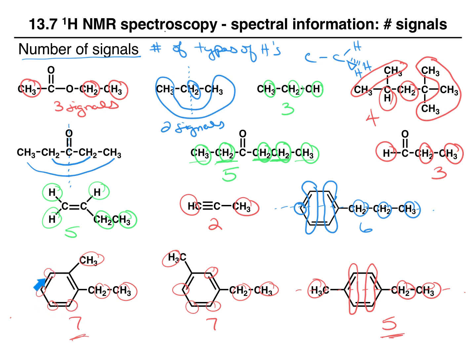Sometimes we will be able to identify 4 separate hydrogens in the aromatic region, and we can get that detail. In other cases, we're just going to focus on how many hydrogens are there. So looking at the compound, you should predict the number of signals. But looking at the spectrum, you need to be a little bit flexible in your interpretation of how many signals there actually are, because different signals that are similar to each other can overlap, which makes it a little bit harder to distinguish.